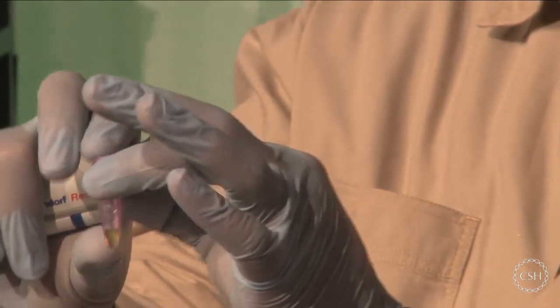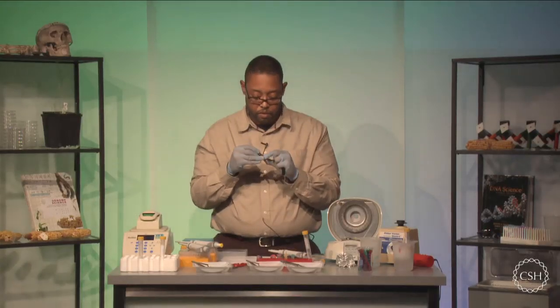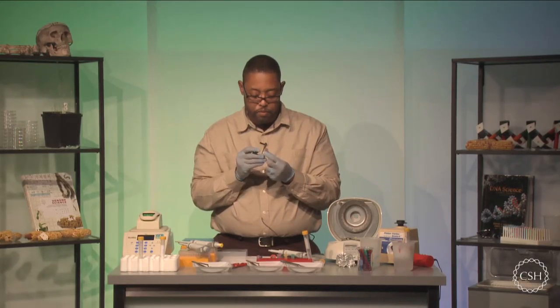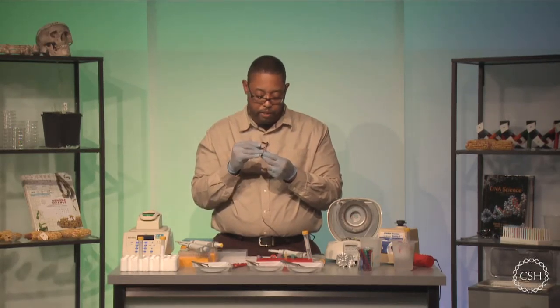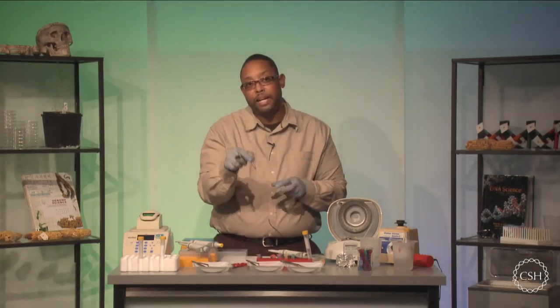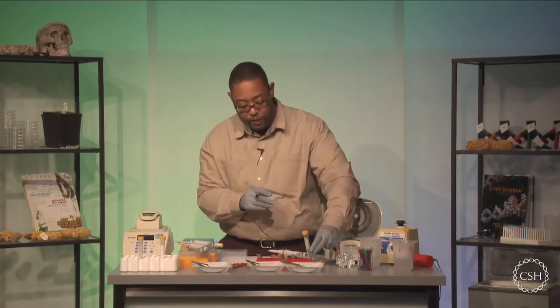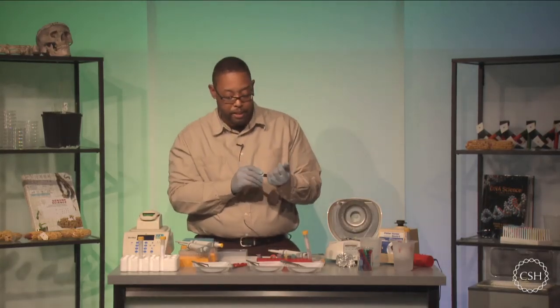So now that I've added that supernatant to a fresh test tube, I do need to label it. That's one, and that it is my plant. But I also want to make sure that I'm taking the old tube. I can either store it, or if you're sure you're not going to need it, you can throw it away. I'm just going to push it off to the side because I may need it in the future.